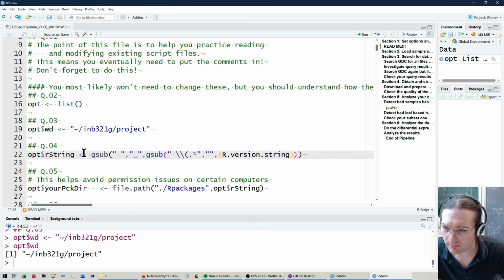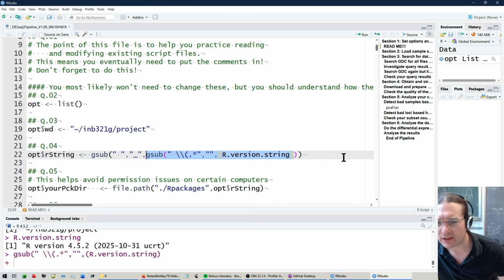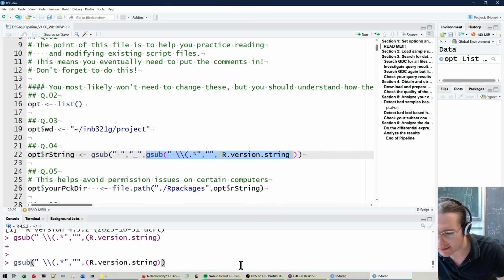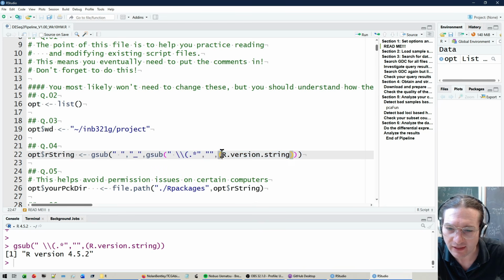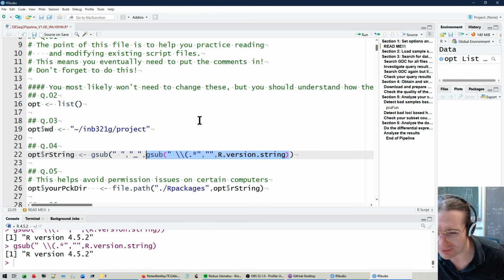Next up, after having set that, we're going to get a couple of pieces of information. So the first thing I'm going to get is this rstring version. That's all of this text down here. That's not the most useful thing. However, if I run my gsub function and I correctly add in parentheses, actually I guess I could fix that. There we go. First change, made it to line 22 before having to tinker. This is always the problem with this video.